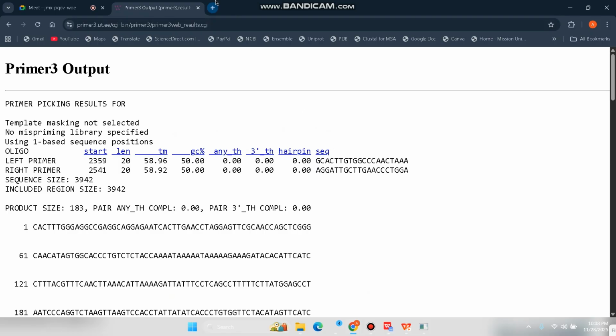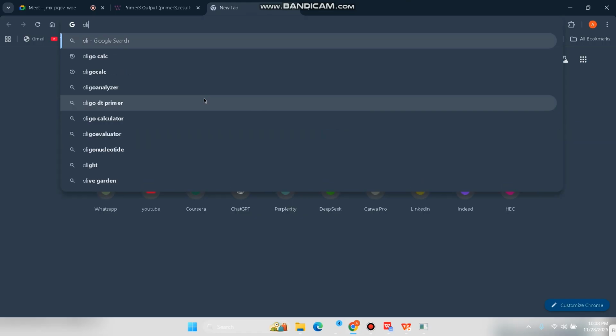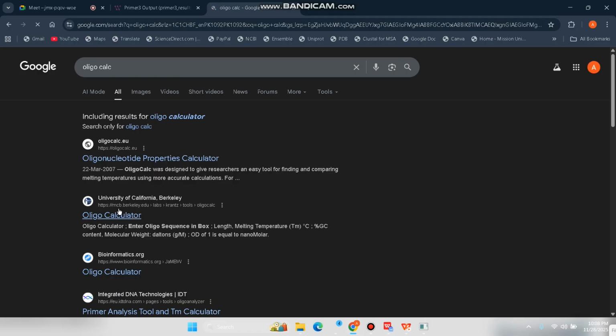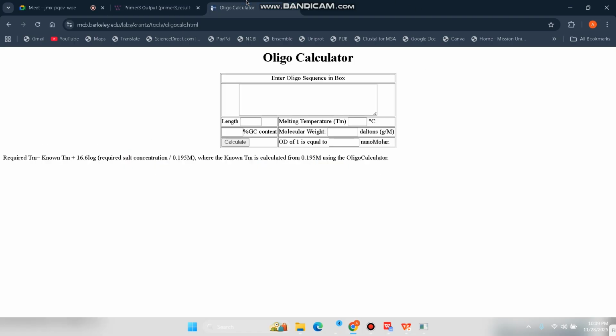Now you just write here OligoCalc, and select the University of California, Berkeley OligoCalc. It is open. Just copy the left primer and paste it here, and click on calculate.